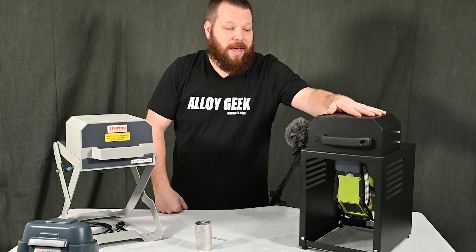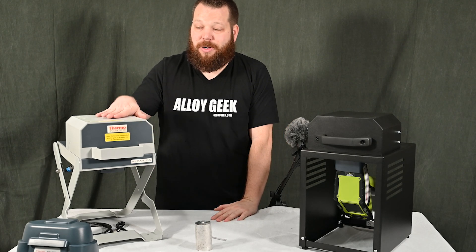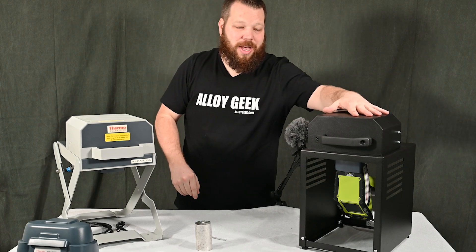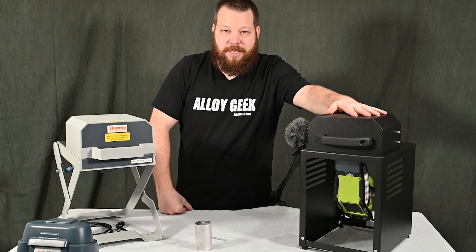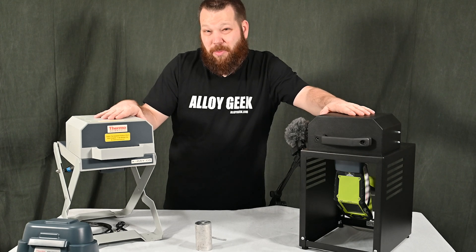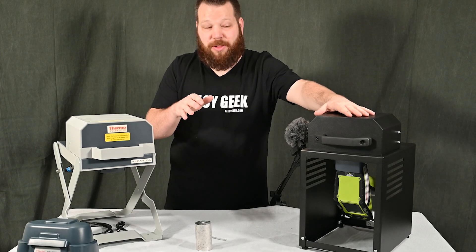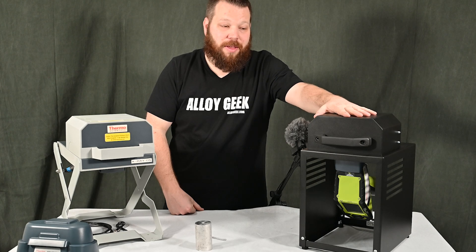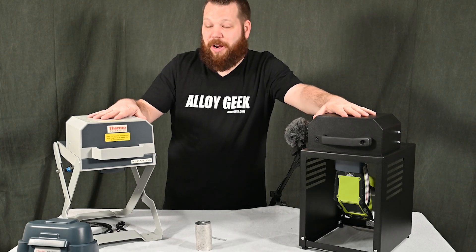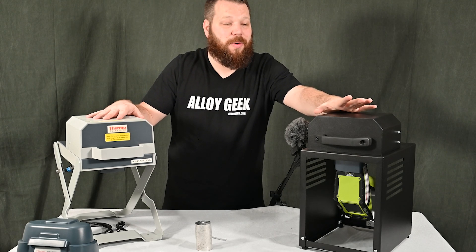The desktop test stand comes in a sleek black color — it looks good on your desk. All the ports have been simplified to just the USB and the jumper cable — it's a nicer, more modern test stand. The Thermo portable test stands have some legacy technology and are heavy at about 20 pounds, but the desktop test stands are easier to use when set in a lab. The Thermo units are a little more expensive if you want the authentic product from Thermo, but if you want to save money with something that looks great, go with a desktop test stand — they're in stock at AlloyGeek and ship same day.